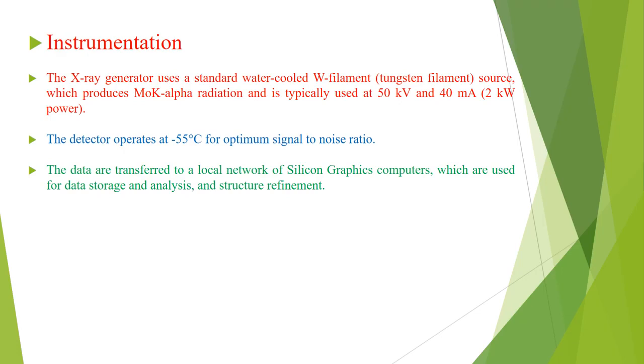The CCD, charge coupled device, area detector has a two-dimensional array of photodiodes in the form of 1024 by 1024 elements coupled by fiber optics to a light-sensitive phosphor screen. When X-rays strike the screen, light is produced, the intensity of which is measured by the photodiodes.